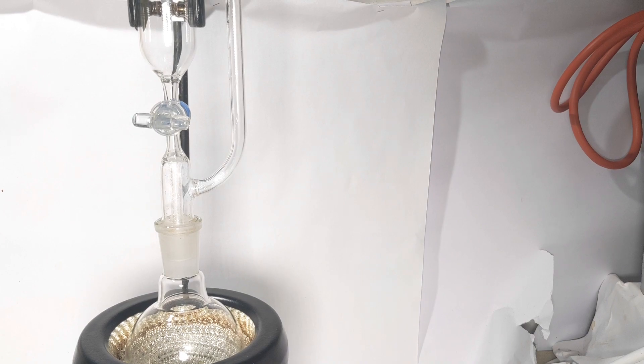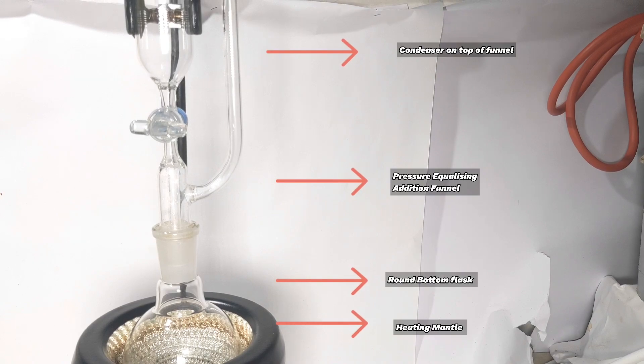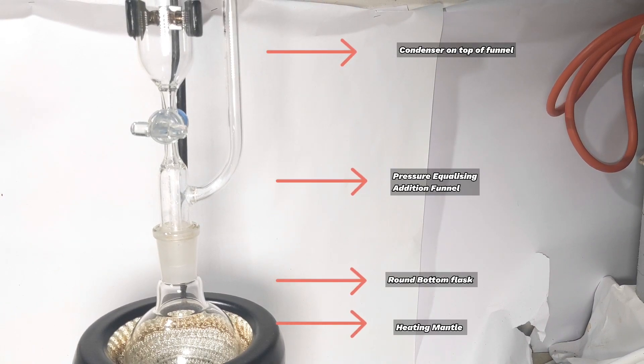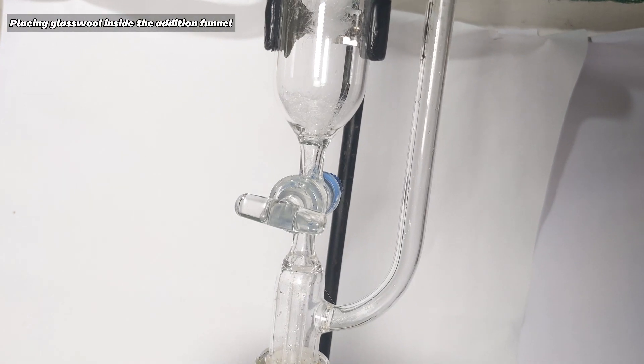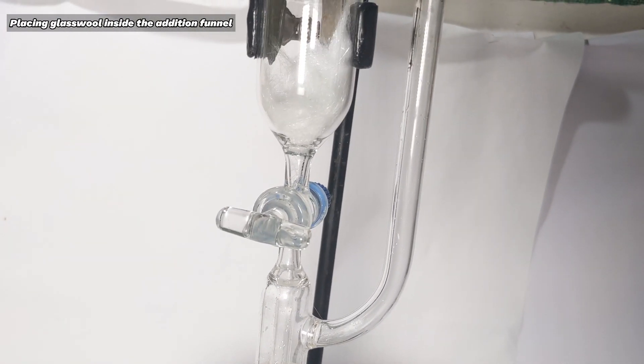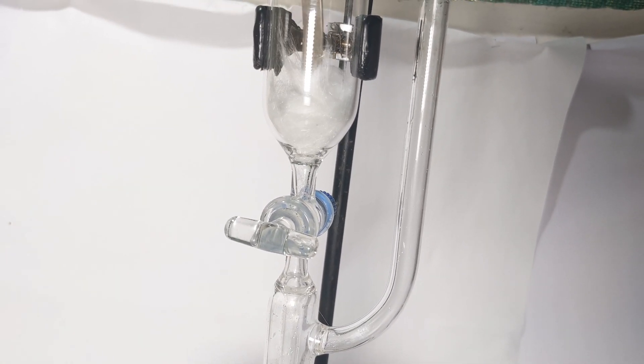Start by setting up the following: a 250 milliliter round bottom flask was placed in a heating mantle stirrer and a pressure equalizing addition funnel was placed on top of it. Some glass wool was placed inside the pressure equalizing funnel and it was pushed down using the back end of a steel spatula.